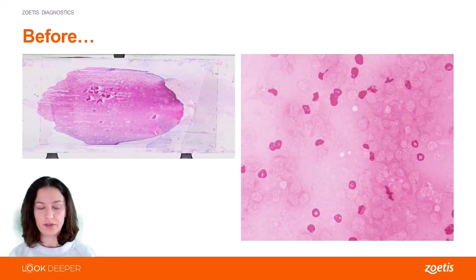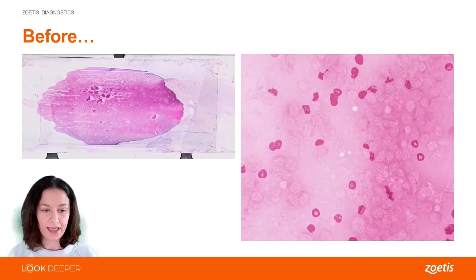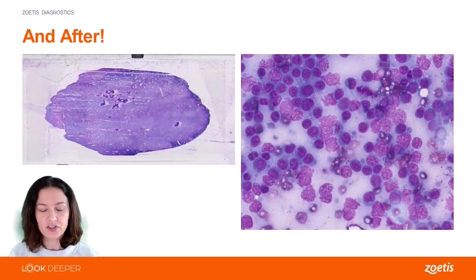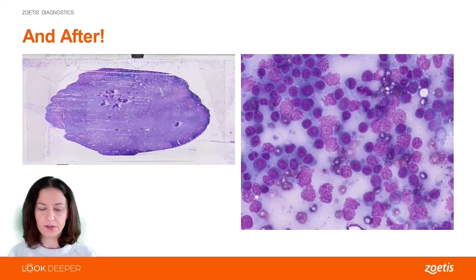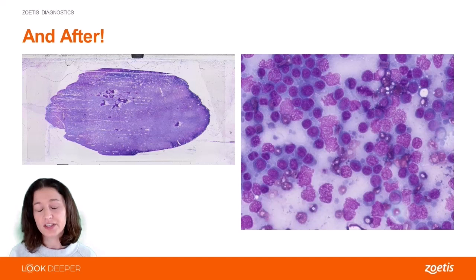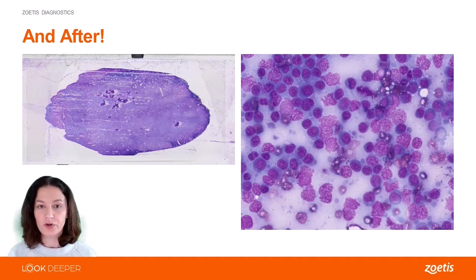We were able to do that with this sample. Pay attention to the spread — we've got little islands of cells. On the next image, it's the exact same slide, the exact same distribution, the exact same little islands of cells, but with the restaining, look how beautiful that is. I now have contrast between the red cells — they're a pale orange in the background — and my nucleated cells are a very nice purple blue. We were able to go from a non-diagnostic understained sample to actually getting a diagnosis of lymphoma for this patient.